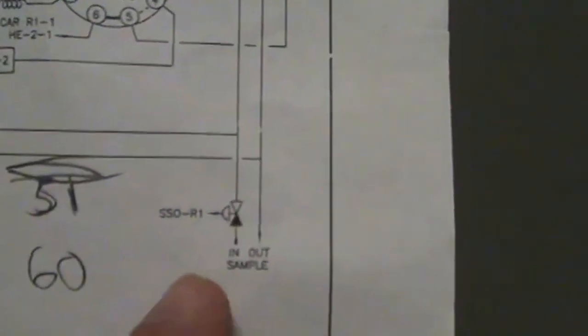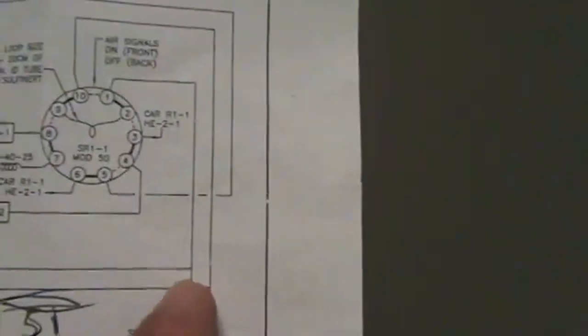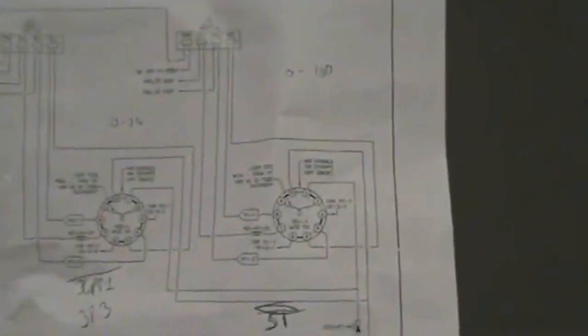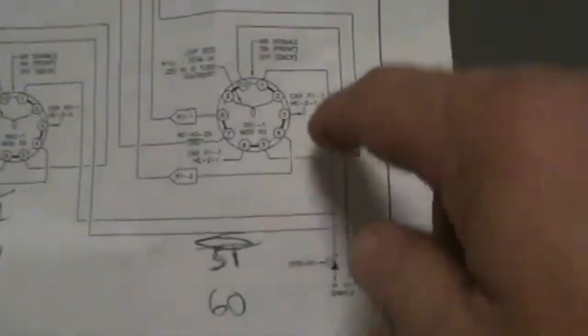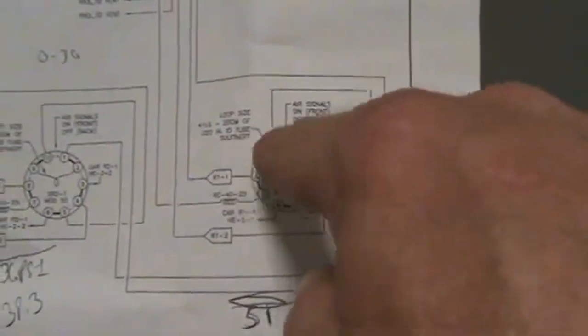So what's going on is we are bringing in our sample, and we're going to go through our SSO, sample shutoff valve. It's going to come up and it's going to T, and it's going to parallel feed both Model 50s. It's going to go in on 1, internally go to 2, fill the sample loop 9 to 10 and out. Same thing there, same thing there.